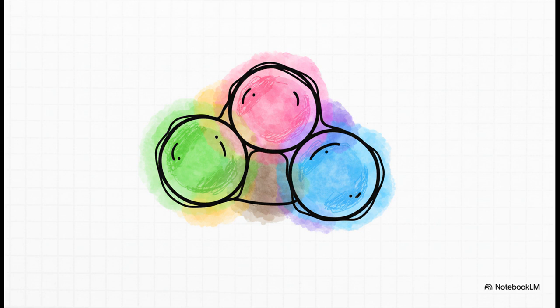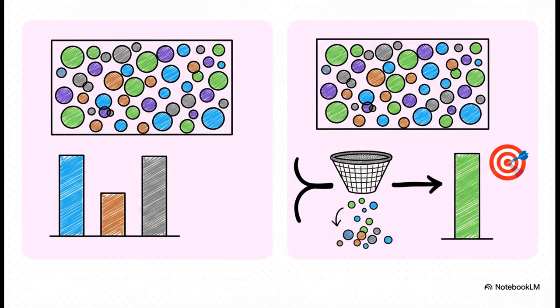This whole mess is called spectral crosstalk, and trust me, it can totally wreck an experiment. This is where FluorSW comes in with a fantastic fix called precise mode. Instead of just accepting any color signal it sees, it uses something called dominance logic. Basically, it tells the computer, look, don't just count any faint green you see. Only count a pixel as green if the green signal is way stronger than any other color in that exact spot. This super simple rule is incredibly powerful. It stops the colors from bleeding and makes sure the data you get is clean.